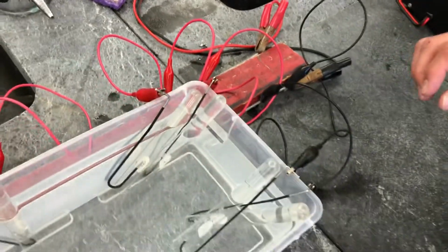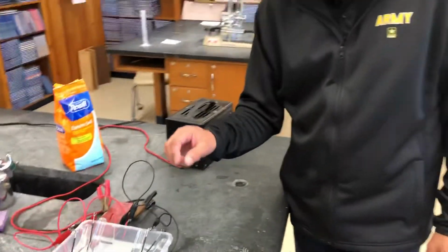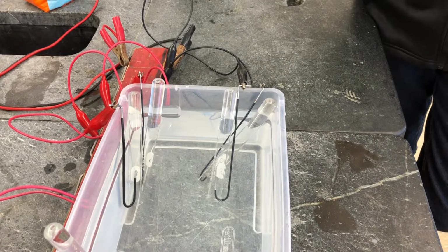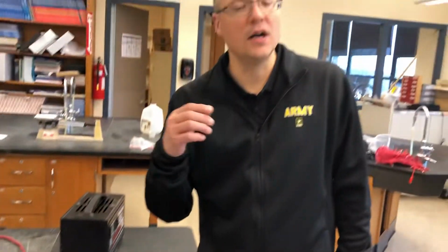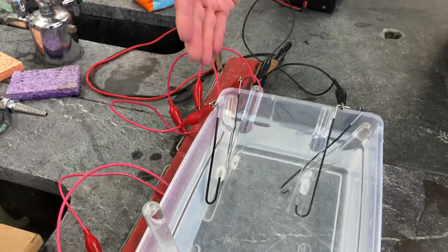Now, hydrogen is on the periodic table. It's on the left side of the periodic table, and that makes it a positive element. And due to the law of electric charges, the positive hydrogen will be attracted to the negative electrode. So we expect to have hydrogen be produced here on the black electrode side. Oxygen, likewise, is on the right side of the periodic table, and it is negative. And since opposites attract, it will go to the red positive electrode side.